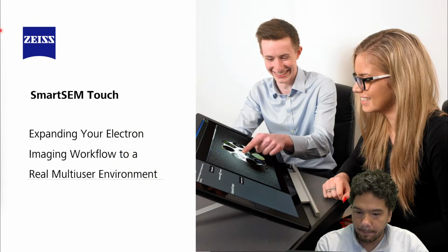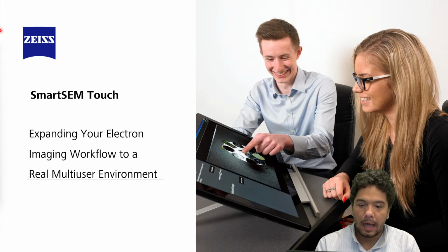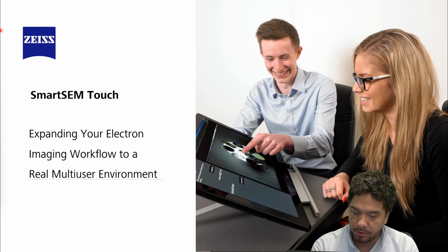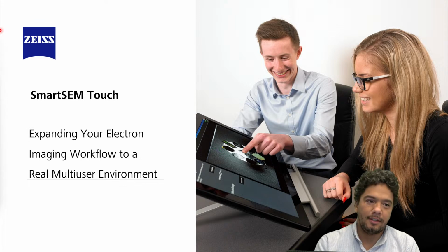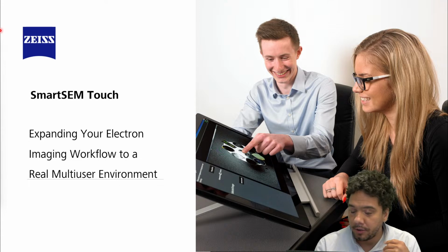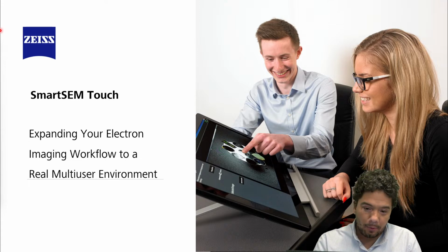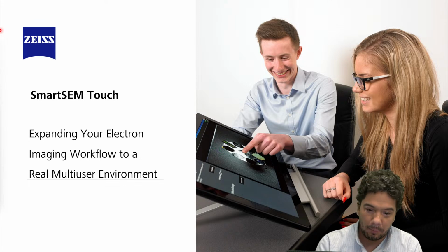Okay, here again, our SmartSEM Touch platform is a platform that allows you to expand your electron imaging workflow to a real multi-user environment. We are going to discuss some issues that could sound familiar if you have been using an electron microscope for a while, and see how this platform can help you in the day-to-day operation of your microscope.